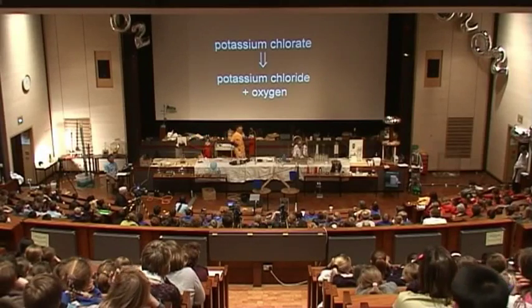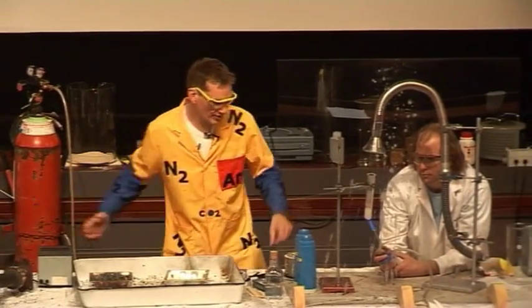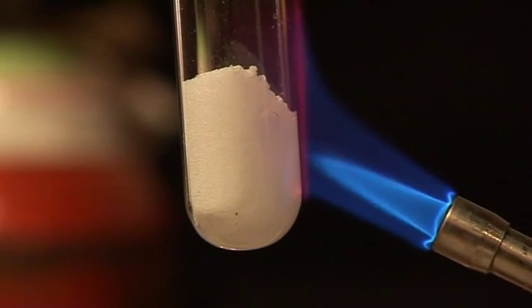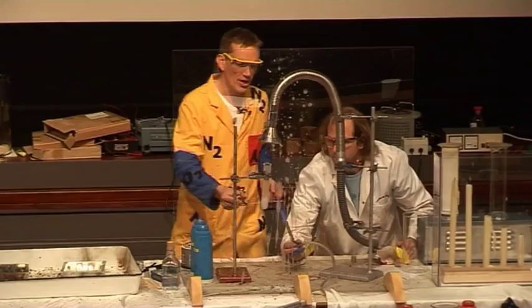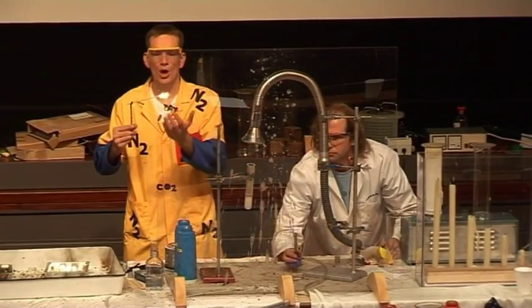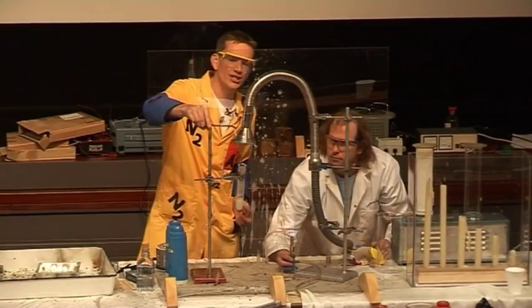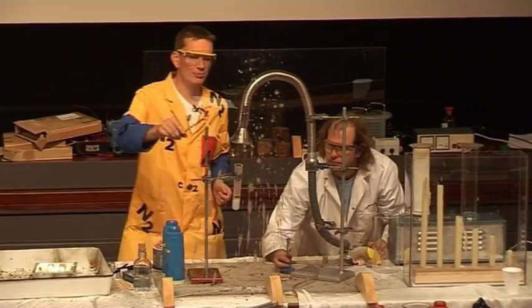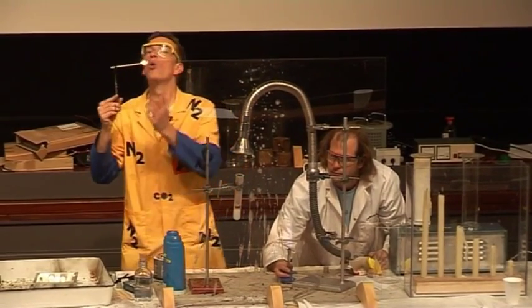This is not sodium chlorate but potassium chlorate, and Chris here has been heating up some potassium chlorate, releasing some of the oxygen. I can show this with a wooden splint. What I'm going to do is blow out the splint — so now it's not alight, it's just glowing — but if I put this into the tube, the oxygen that's being given off here relights the splint.